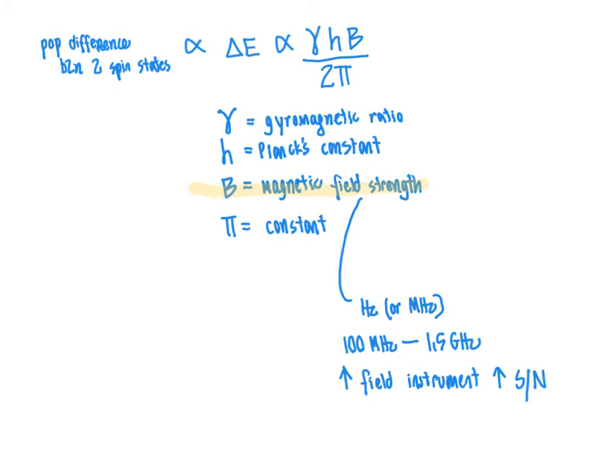And so if you were given the choice and working with a molecule that you had very limited quantities of, such as a protein that you'd painstakingly isolated just a few milligrams of, or a small molecule that you had been able to synthesize just a few milligrams of, it can be very useful to utilize the highest magnetic field strength NMR instrument possible. In the chemistry department at UNF, as an example, we have a 500 megahertz NMR instrument. That's a nice middle of the road, middle of the line type instrument. If you instead were collecting data with a lower end instrument, the data quality would be considerably lower. If you worked with a higher end instrument, the data quality would be considerably higher.